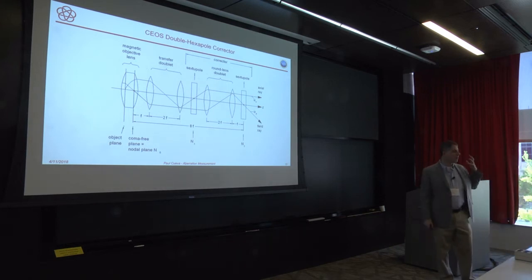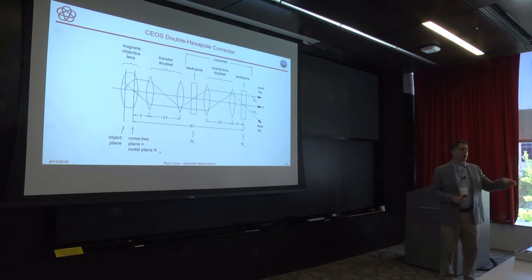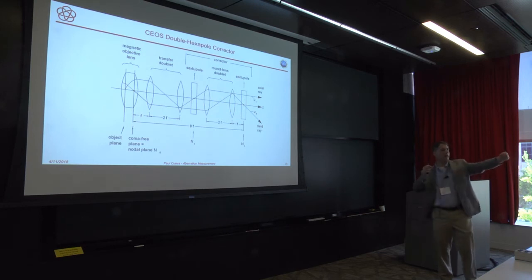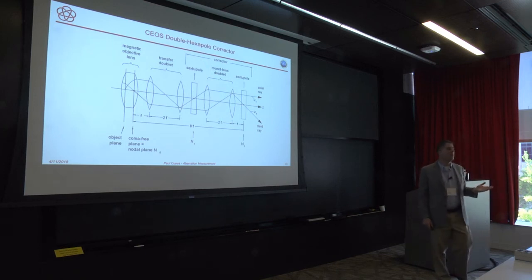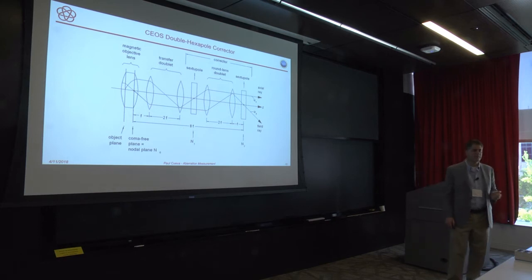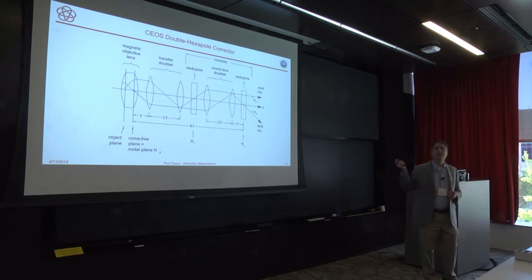Well, it started off with a lot of analytic work and exploiting symmetries, and then putting things back to back and inverting them so that things cancel out, and relying on crossovers. If I have a beam that's elongated in a line, then it doesn't matter if I have horrible aberrations this way, because it's a line and everything's going through at one angle, and then I get to correct things only along the line. It's much more manageable. It's not at all clear to me that this is the optimal way to do it. But then real machine errors, how do they? So that's why 50 years ago, even though people knew this kind of idea, they couldn't build these things.